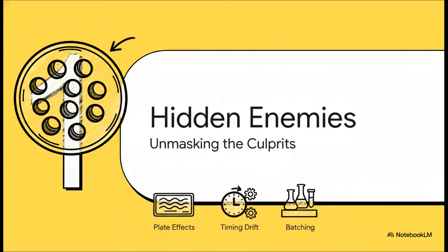Okay, so let's meet these hidden enemies of good data. There are really three main culprits we need to drag into the light before we can figure out how to beat them. We're talking about plate effects, timing drift, and batching.